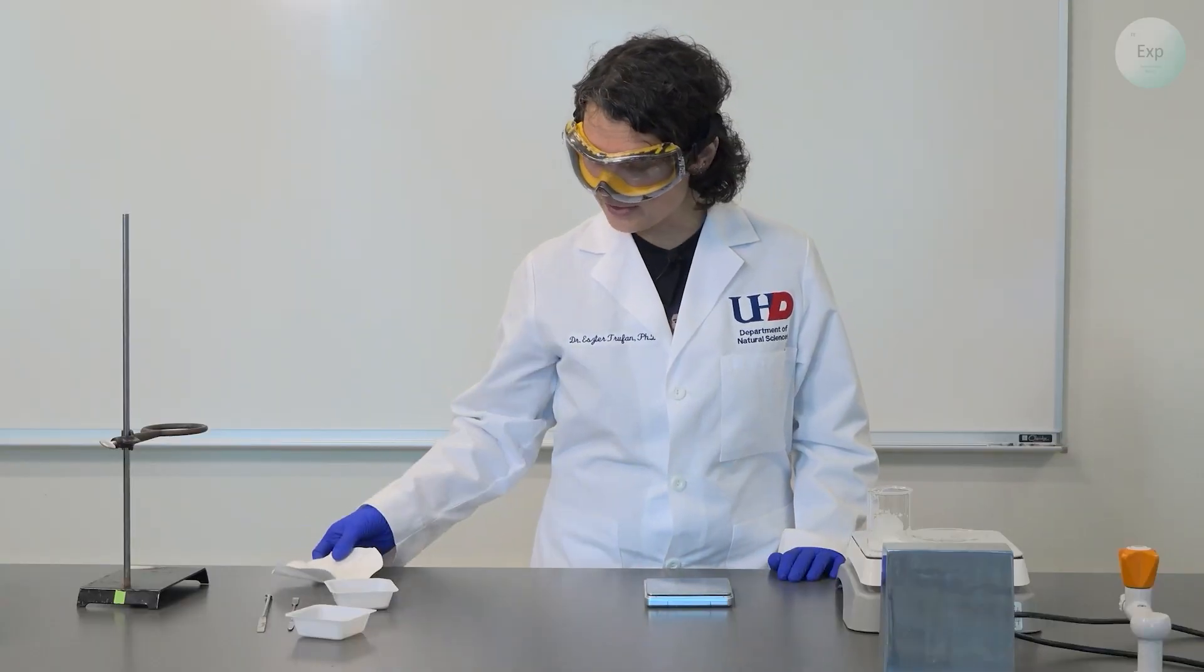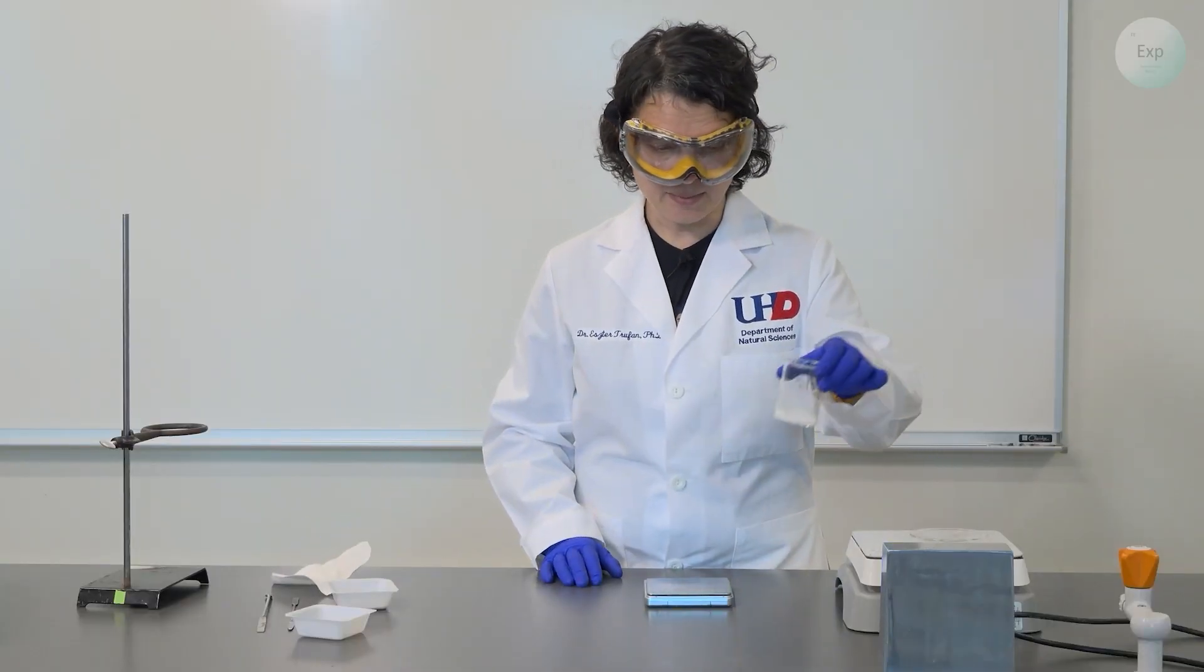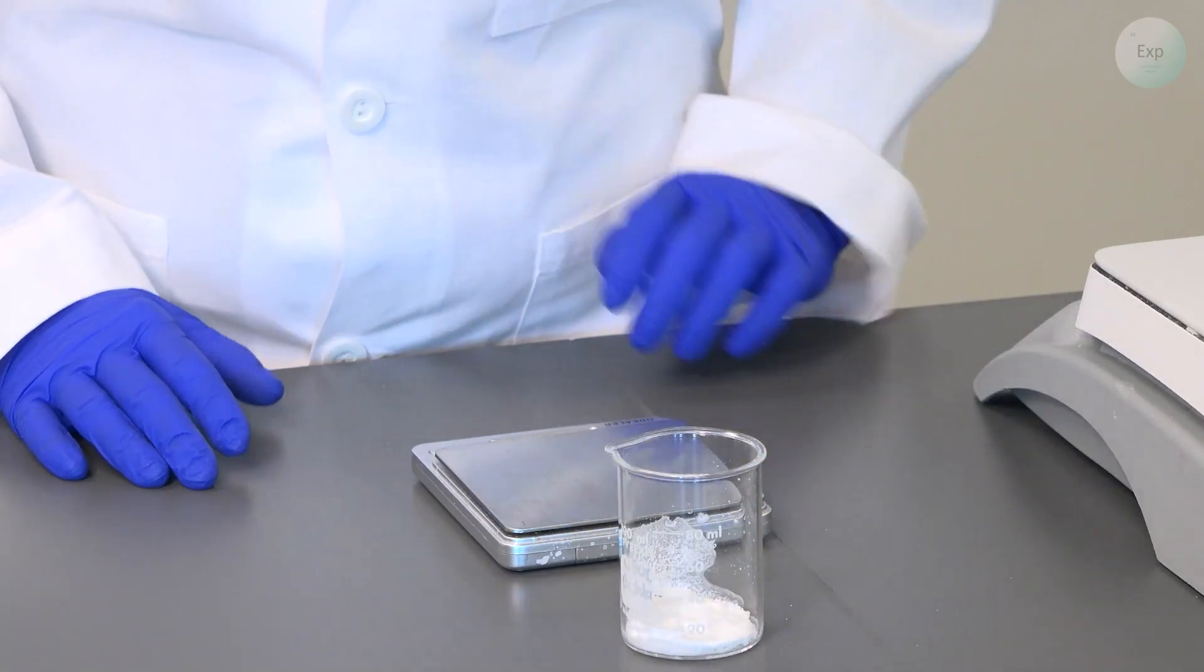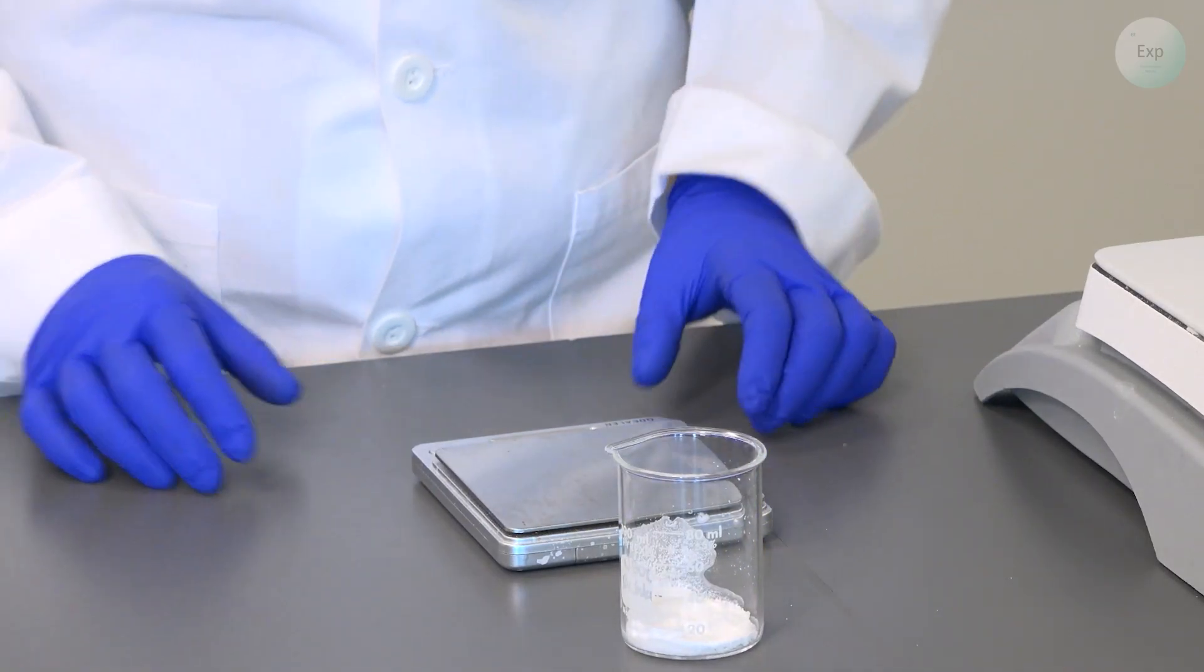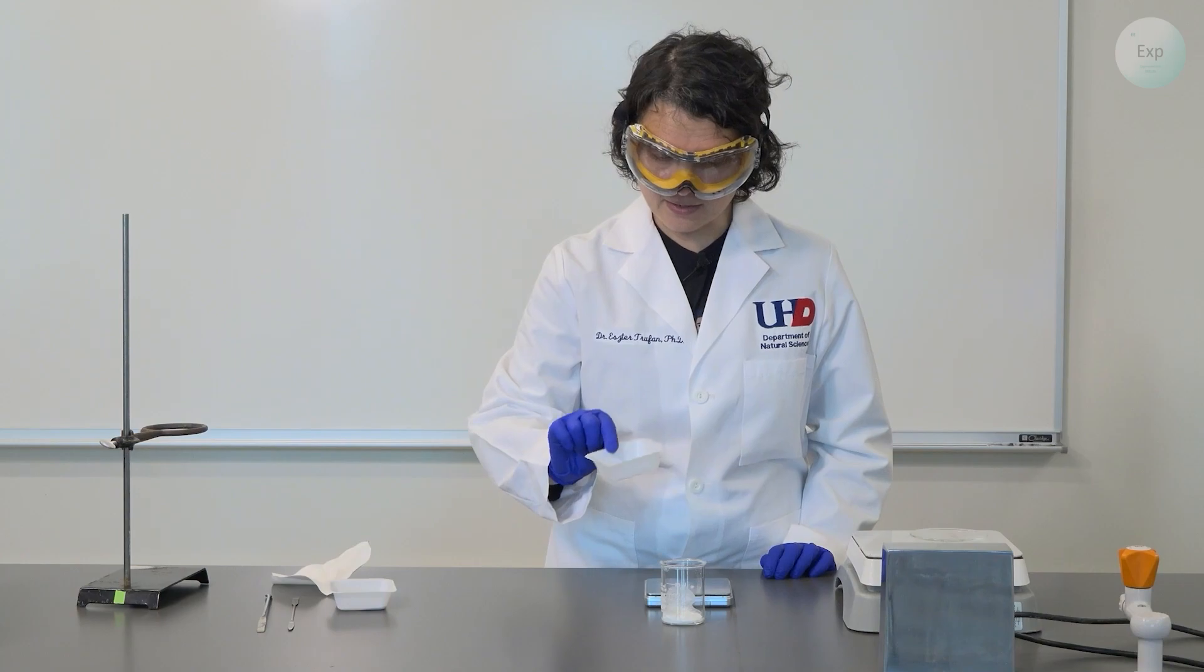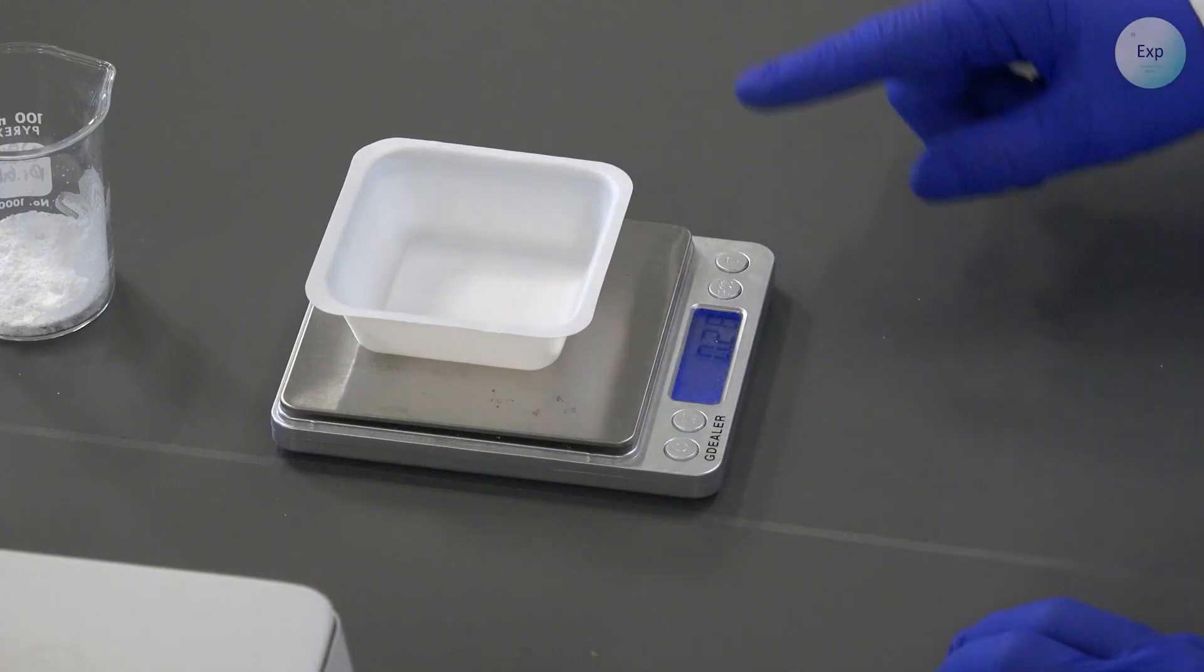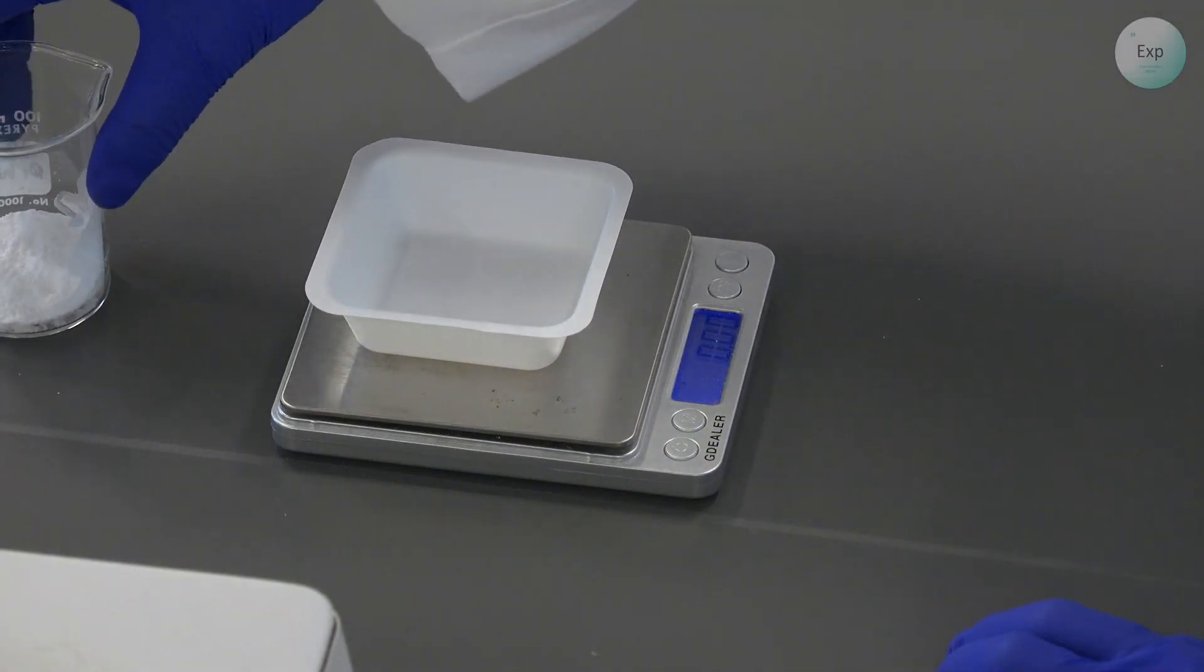Next, we're going to do the same thing with the salt, except the salt is in this beaker and we'll need to scrape it out carefully. The first thing we do is take a clean weighing boat, place it on the scale, and tare it.